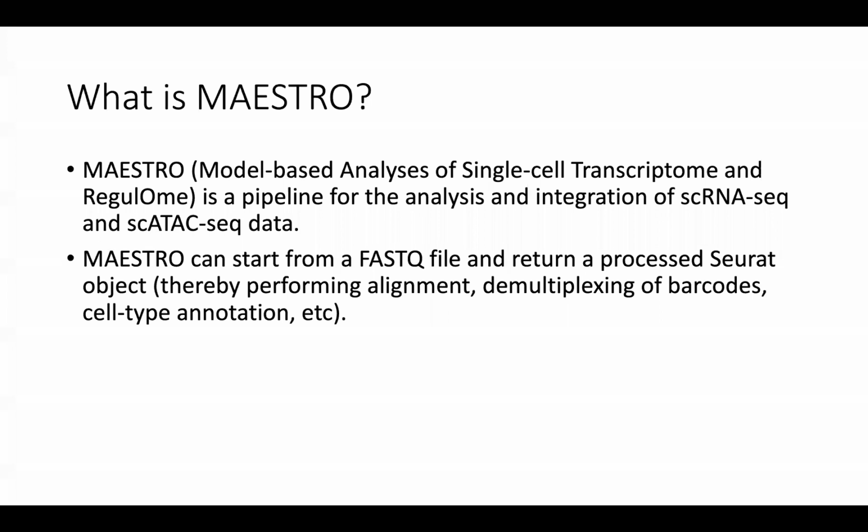The way you can think about it is that it does everything from the point where you get a FASTQ file all the way until you have a processed Seurat object. Seurat is the software that Martin talked about last week that's used extensively throughout this homework. So MAESTRO will take your raw data and create a nice, beautiful Seurat object for you to use for whatever kind of analysis you'd like.